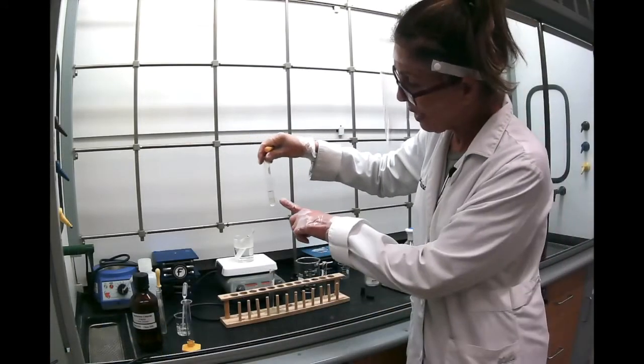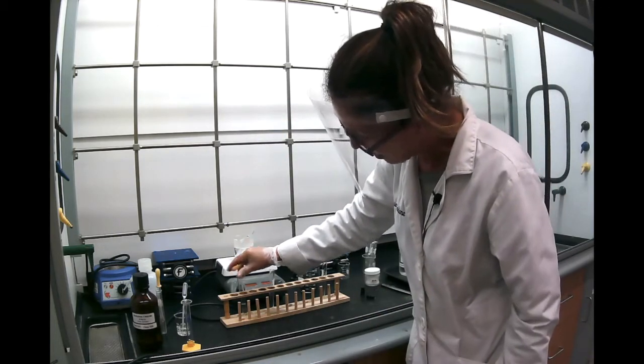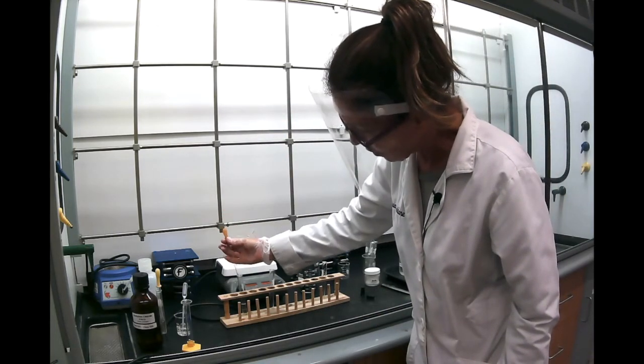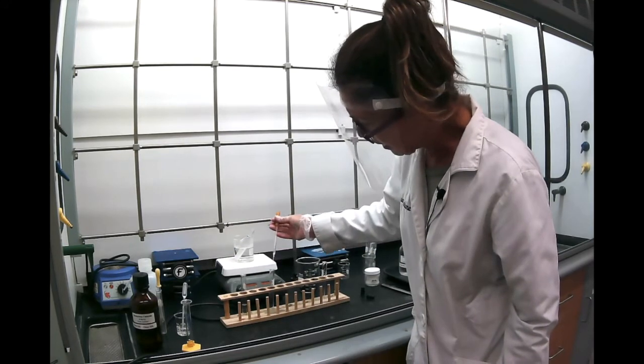So after we let it sit, you can see that the two layers are definitely separated. And just like you did earlier, you remove the aqueous layer and you put it in a clean test tube.